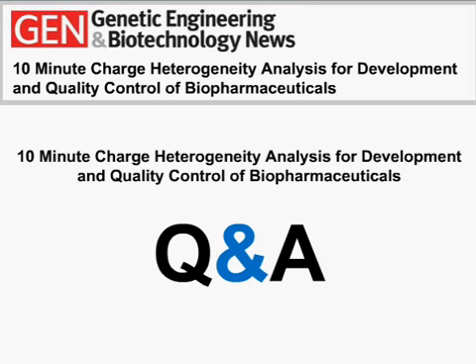Thank you, Carrie. And Karan, given the similar ADC subspecies distribution profiles you observed for CIEF and mass spec, have you tried to use CIEF to determine the drug-to-antibody ratio on your ADC? Yes, we actually have used the CIEF profiles to determine the drug-to-antibody ratio. As I discussed in the presentation, what happens in iCIEF is that even the small molecule on the ADC contributes to the absorbance at 280.